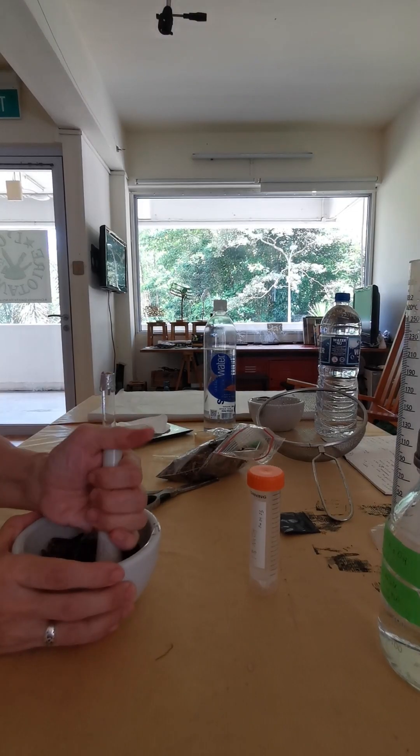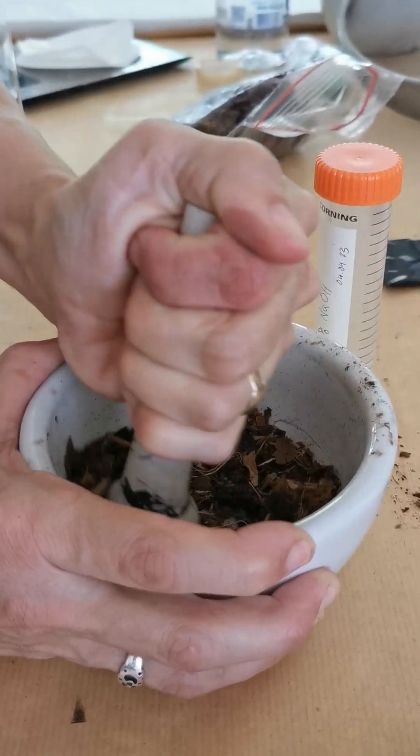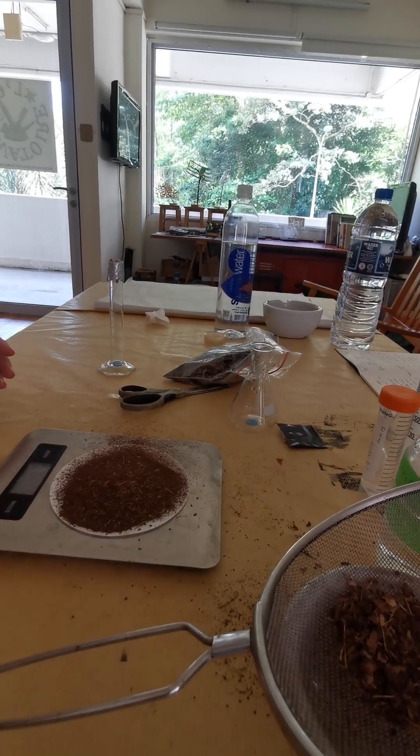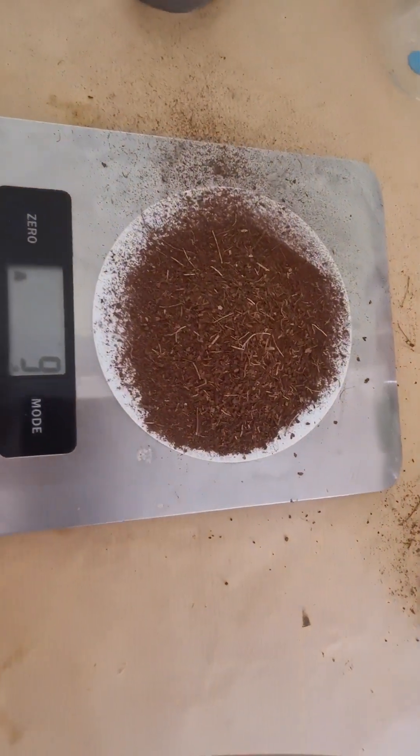Next you need to grind your soil that has been drying for a few days. Grind it nice and small, then sift it and measure 10 grams. I did it over a filter — over any paper will do.